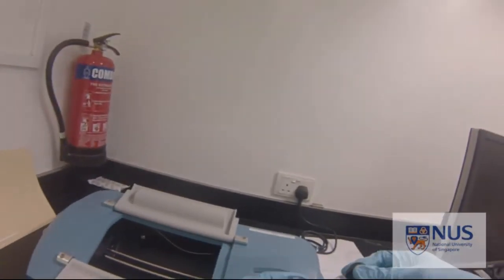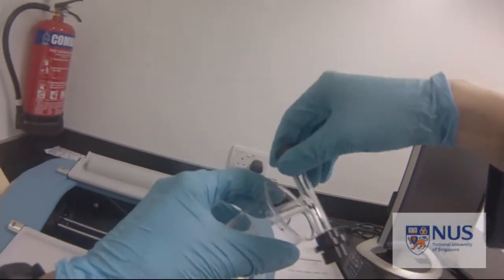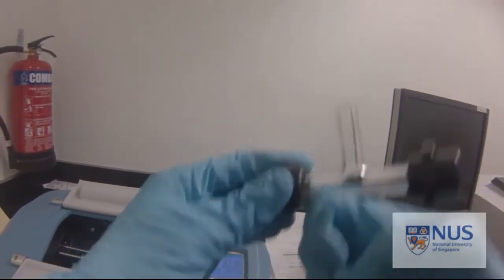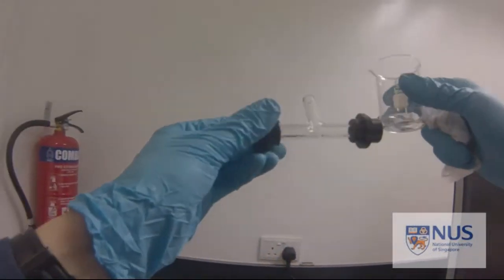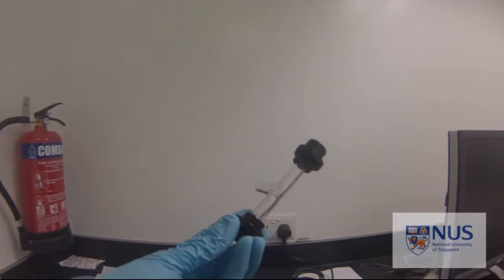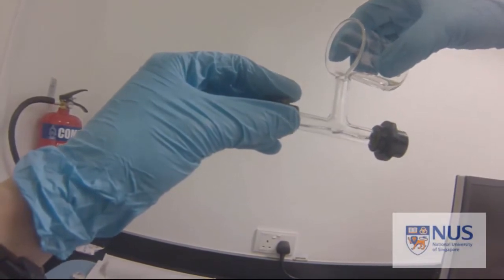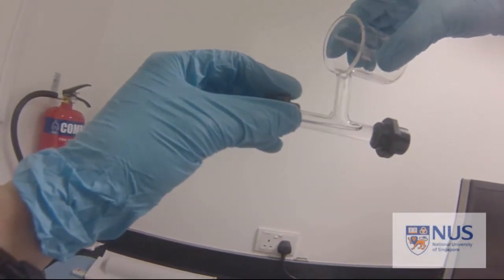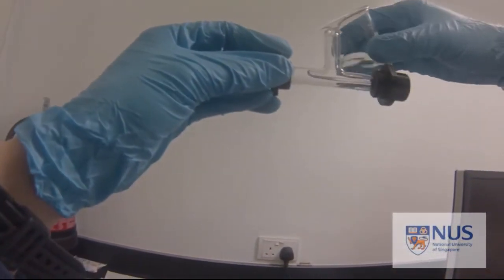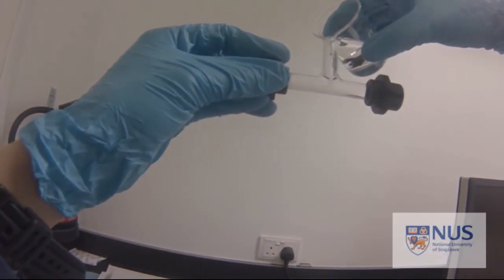Discard the solution and now insert your sample solution. Make sure the exterior is all dry. This is your sample solution, which contains the sample you would like to analyze. Top up — you have to make sure that the meniscus of the solution goes through the t-neck above it.